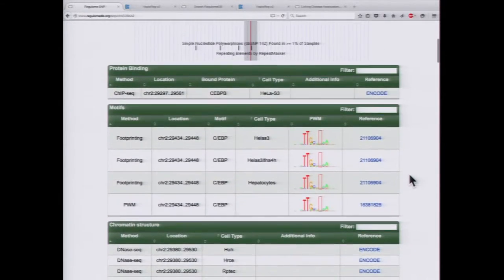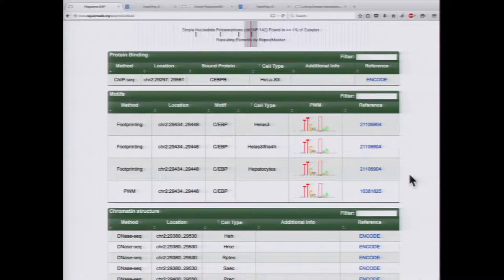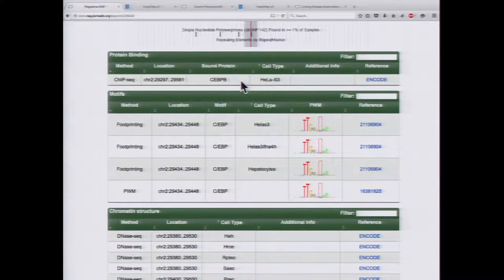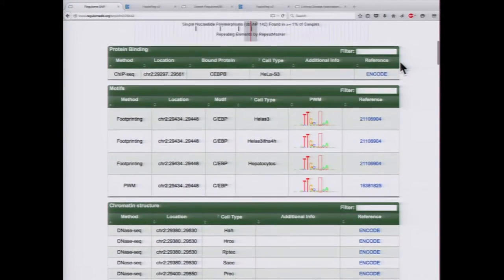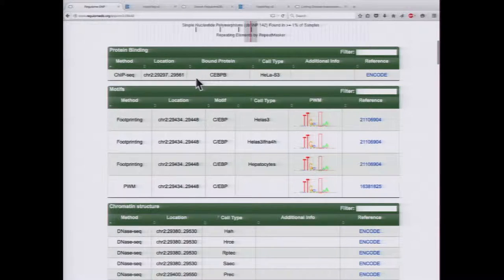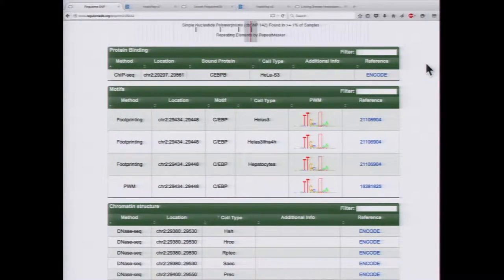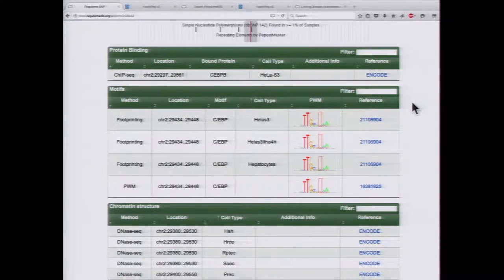When we scroll down, we see everything broken down into specific categories. We have protein binding data from ChIP-seq — for example, a transcription factor CEBPB that's bound to this region in HeLa cells. For all these cases, you have information about the assay, cell type, and tissue type, which is really important when studying these SNPs. You also have the reference — in many cases from Roadmap or ENCODE, but if the data is from a specific paper, you have that reference too.